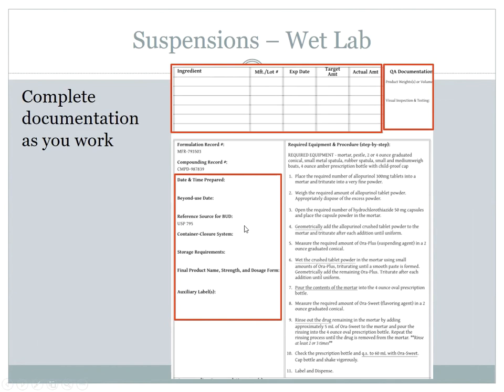So I do want to talk about the procedure here a little bit with the exact method. What is different? I want everyone to do this on your sheets. It's really important that you circle this part of the step where it says rinse out the drug. We did not have to do that in the excess method because we just poured the pre-made suspension into the bottle. Here, you're making part of the suspension with the drug. You're going to pour part of it into the bottle, but you're using color. The reason we chose these drugs is they're colored. There's going to be a yellow color. Look, there's still going to be a bunch of yellow left in your mortar. That's drug. Remember, in the exact method, you need all that drug.